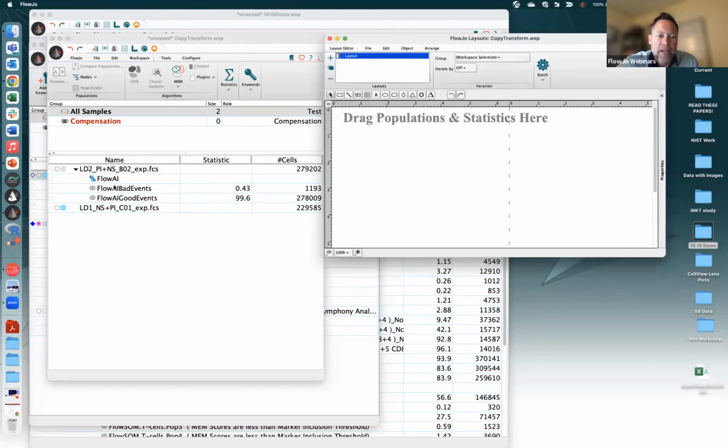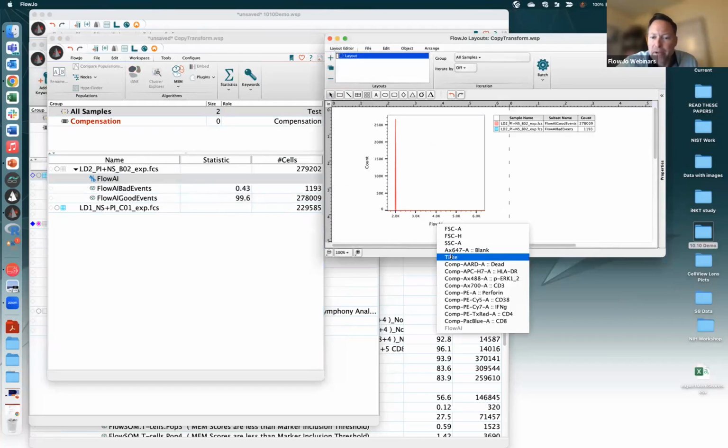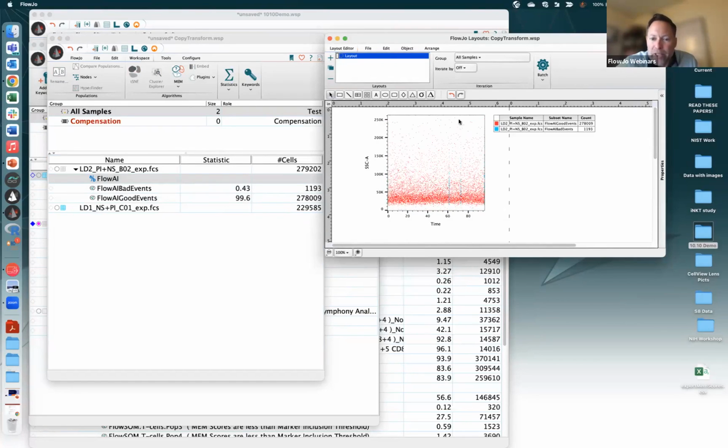And if we wanted to check the data out, we can even overlay good events versus bad events, pop this versus time. Maybe not a count, but just pick a parameter. Let me actually change the colors to make that a little easier. Let's do just gray for background, red for bad. We'll just flip them. Here's those 3 or so, and then the beginning moments where the flow rate looked off, and then a smattering of red dots here and there are events that were probably stuck to one of the dynamic ranges. So I think that's a good way to look for any kind of technical variance that happened during acquisition. So there we go, checking for bubbles.